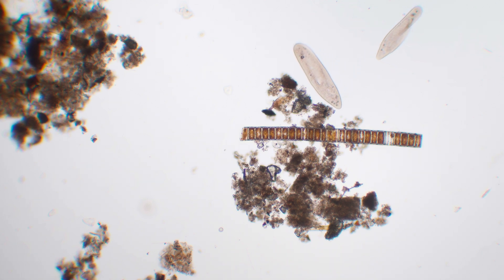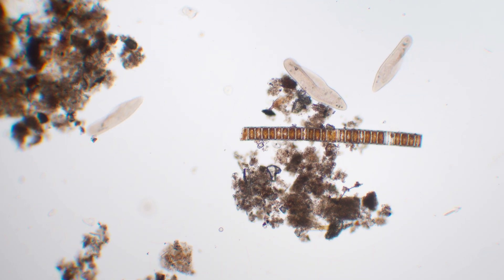What I've got for you today are three objectives. They're all 10x objectives, but one is an achromat, one is a plan achromat, and one is a plan apochromat. What we're looking through right now is a 10x achromat, and specifically this is the 10x achromat that comes with the Journey to the Microcosmos microscope kit.